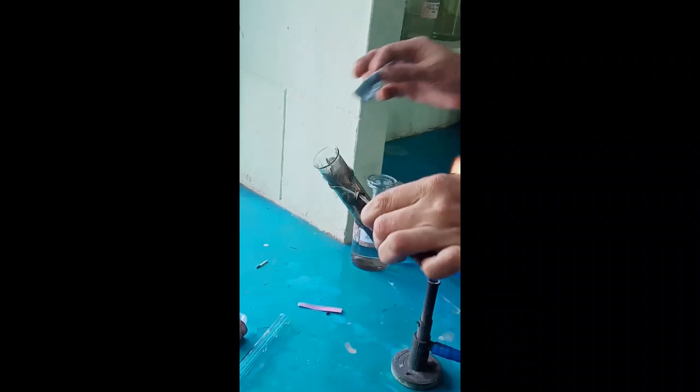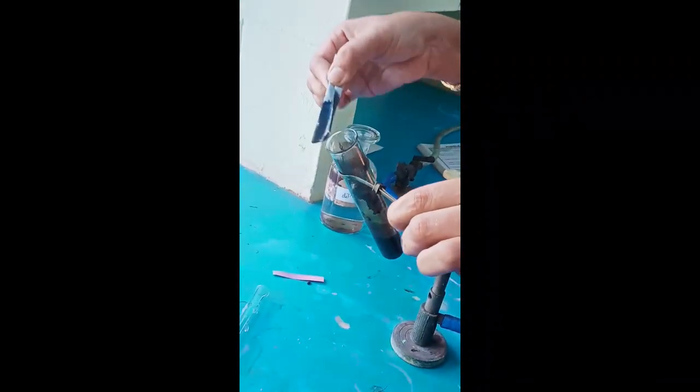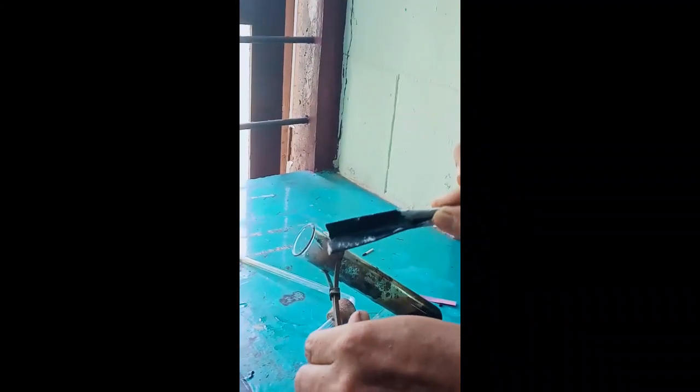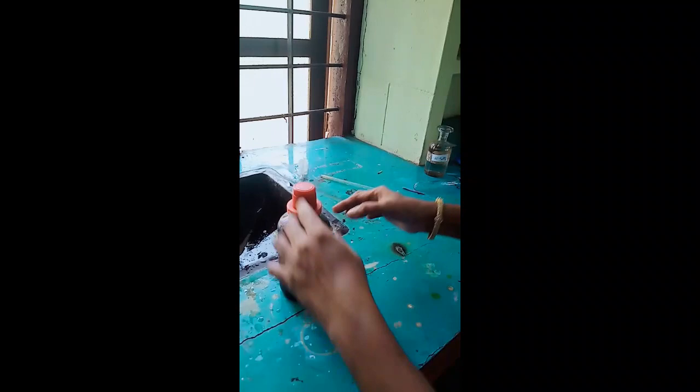A starch-soaked paper turns blue-black. Can you see? The starch-soaked paper turns blue-black. So see the blue-black color. Starch-soaked paper turns blue-black. Test for HCl.